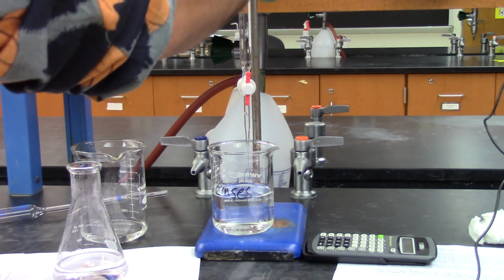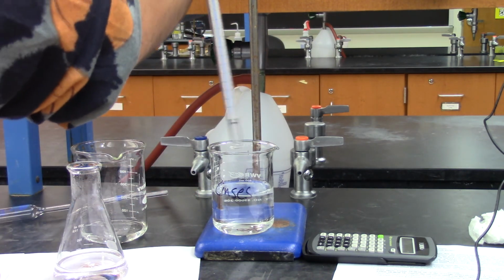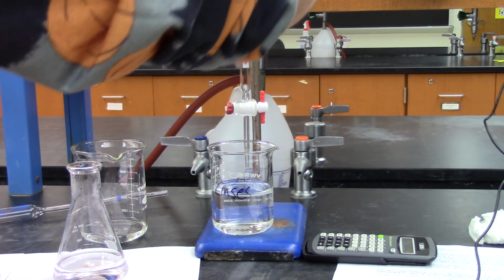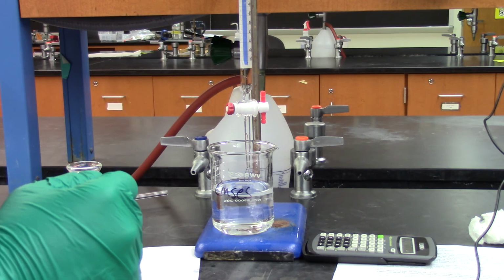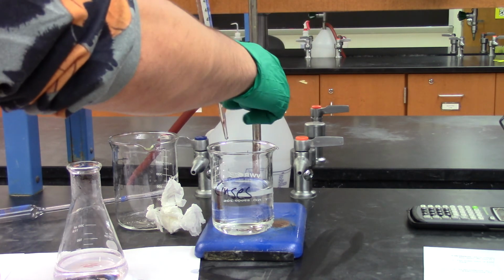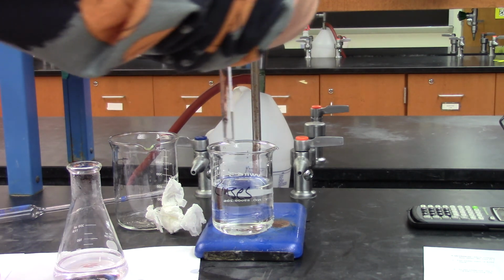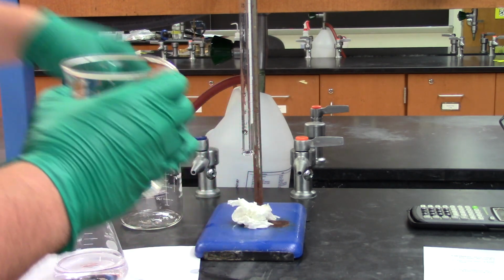And then I'll hang my burette upside down once that's done. I'm going to just do this a bit quicker. It's one. And this will be two. Make sure to clean up any spills around your area, because the base will leave a light residue, and then it will stain our benches. I'm going to hang that upside down. And I usually leave a Kim wipe to grab any excess.